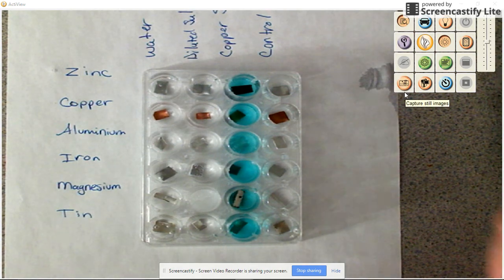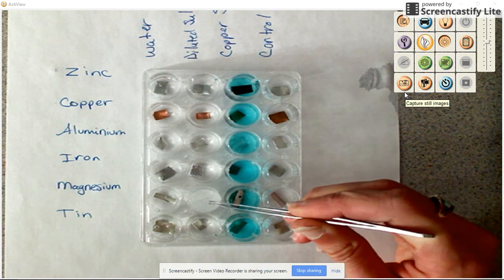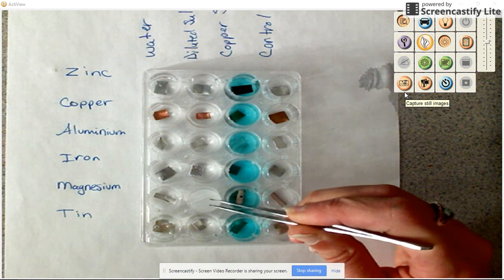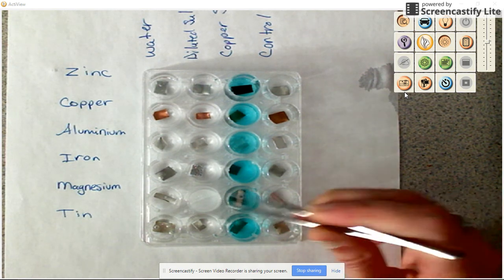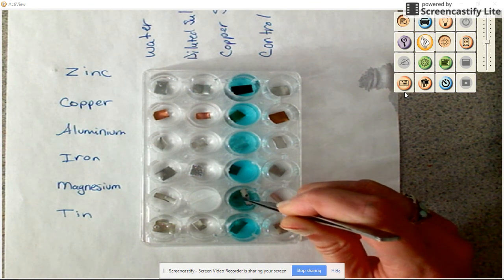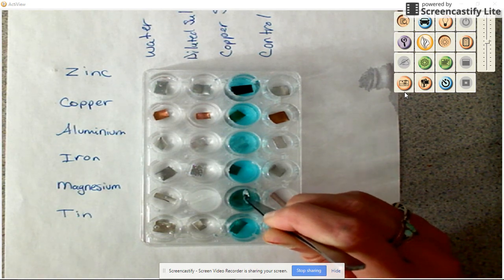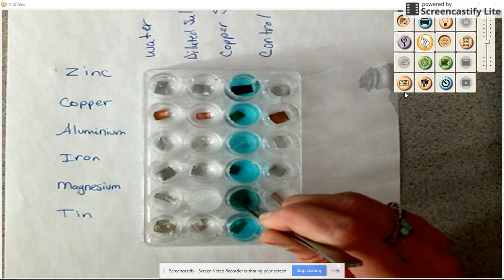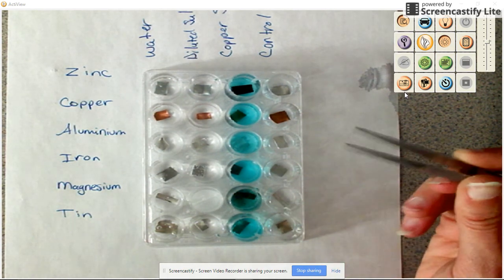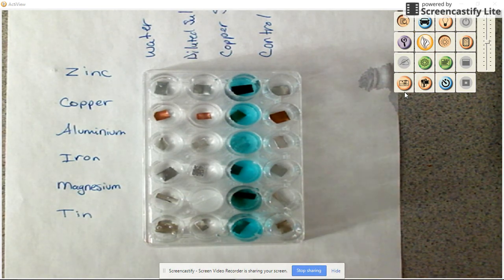So if you look, you can see here we have some bubblings. Here there's fizzings. I know it's really hard to see. That magnesium's still in there, but it's fizzing like an Alka-Seltzer tablet would fizz in water. In this one right here with the magnesium, there's this brownish, orangish precipitate happening and some black starting to form, and definitely some bubbles because it wants to float. Bubbles are an evidence of gas being released or created. We've got bubbles here with the water in the tin.